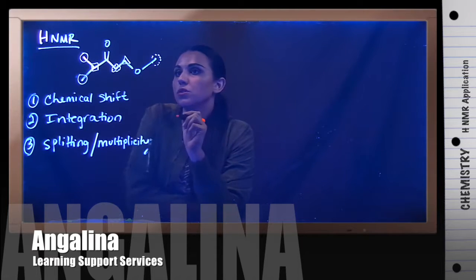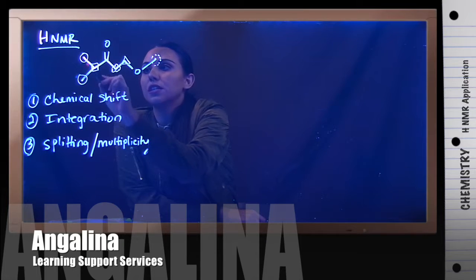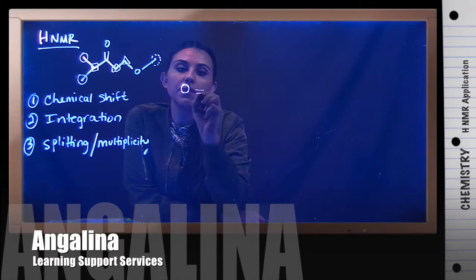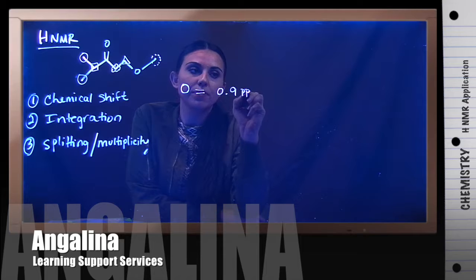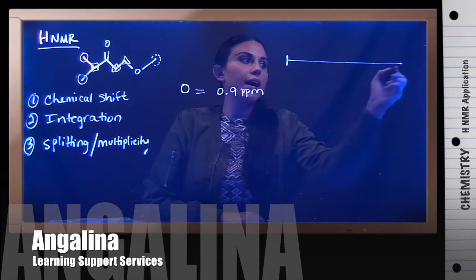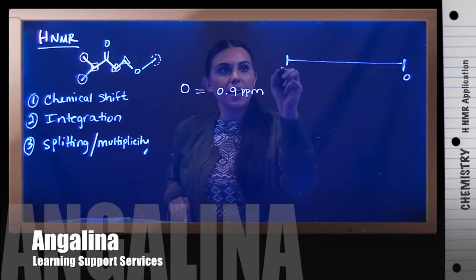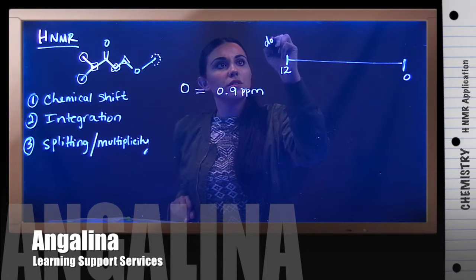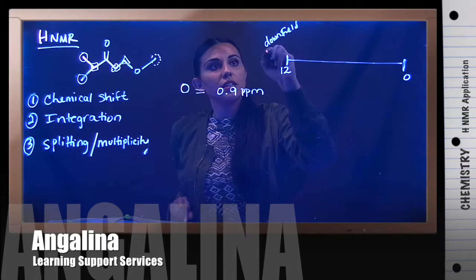When we're looking at the chemical shift, we're first going to identify what kind of carbons we're dealing with. This first signal is going to be a methyl group. Methyl groups typically have a signal around 0.9 ppm. If you recall from our H-NMR spectrum, starting from the very bottom, we're going to have our 0 here, and it's going to get higher going towards the left. So this is going to be downfield, and these are going to be deshielded.